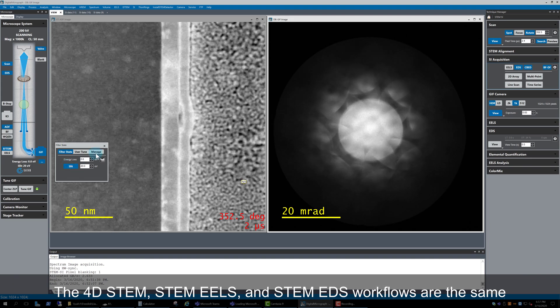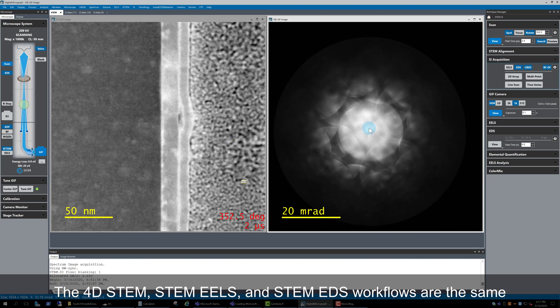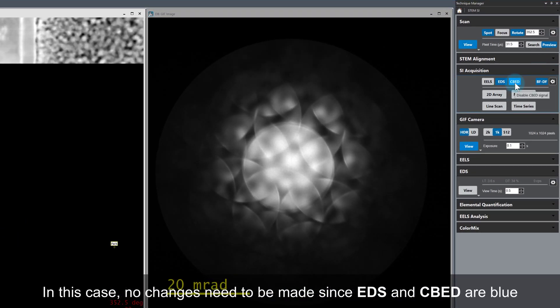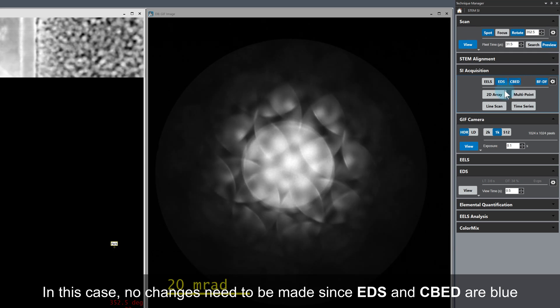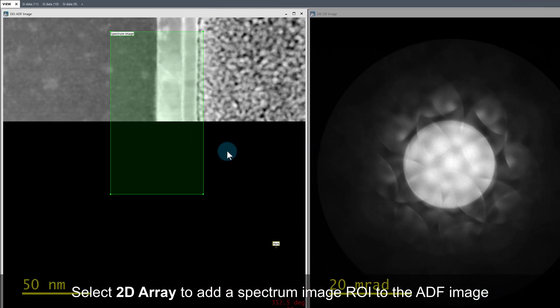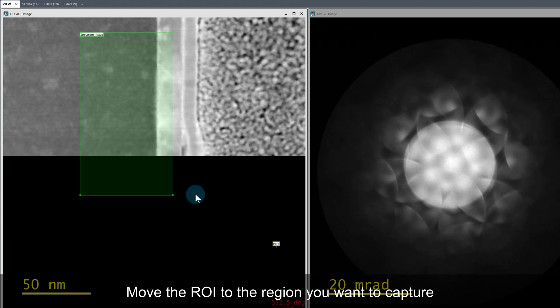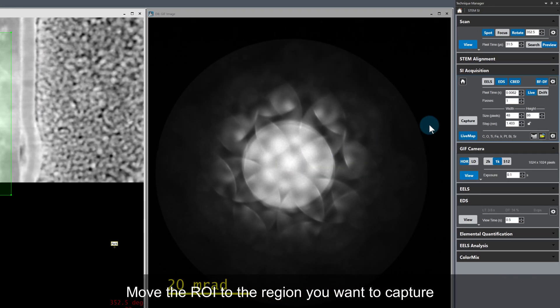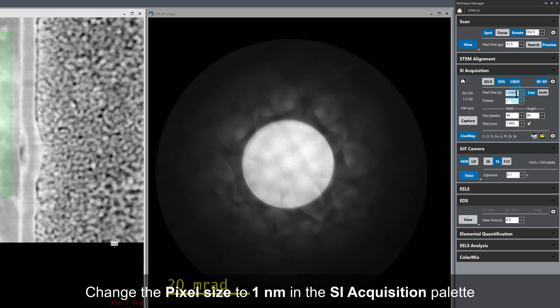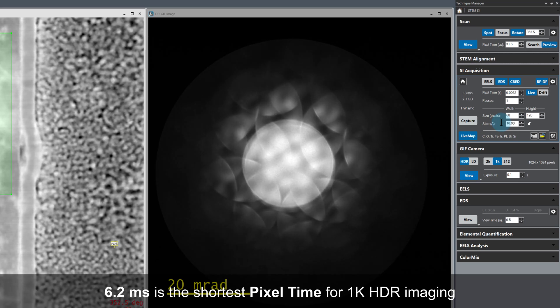The 4D STEM, STEM EELS, and STEM EDS acquisition workflows are the same, so the next steps will look familiar. Switch the scan from search to preview mode and make sure the target signals are enabled. EDS and CBED are both blue, so no changes are needed here. Click on 2D array in the spectrum imaging palette to add a spectrum image ROI to the ADF image. I'm going to move the spectrum image region slightly as I just want to collect data from STO and bismuth ferrite. I'll also change the pixel size to 1 nm in the SI acquisition palette. 6.2 ms is the fastest frame rate for 1k HDR imaging, so I'll leave the pixel time unchanged.